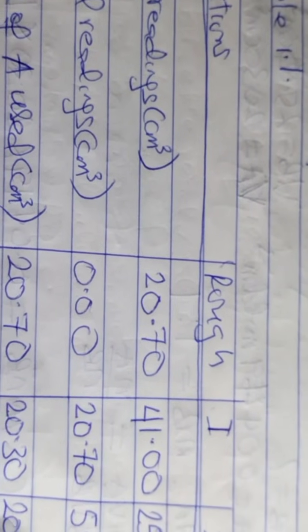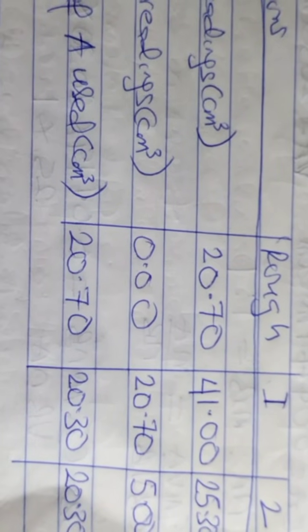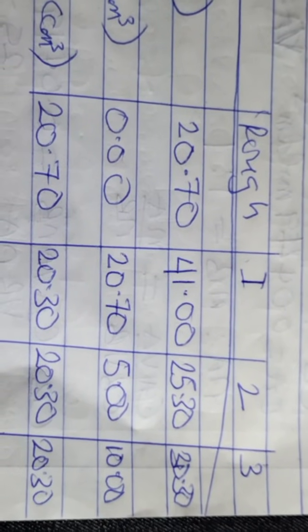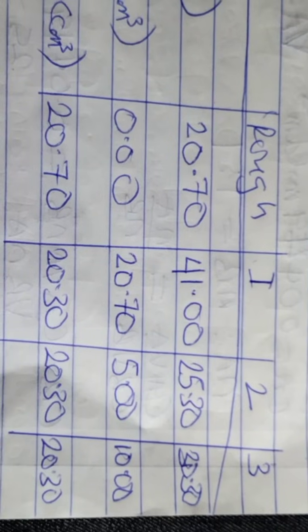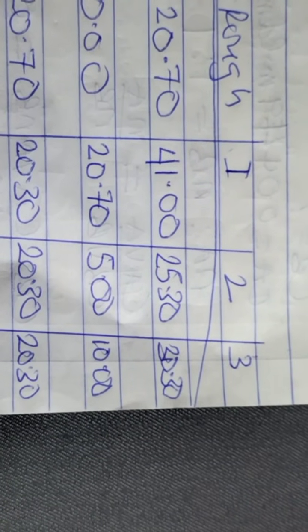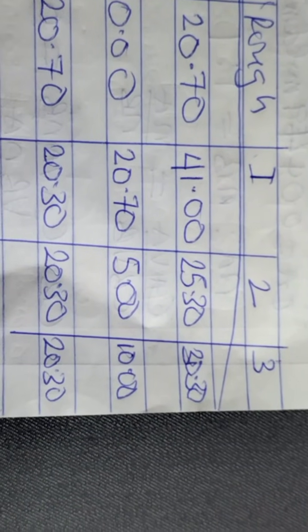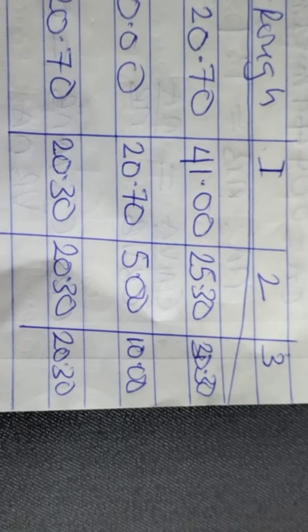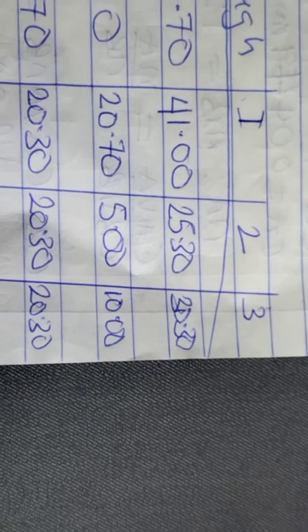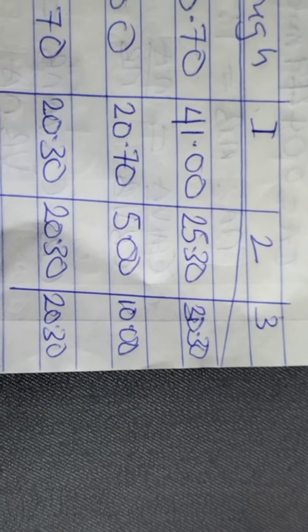We repeat: the rough, final 20.70, initial 0.00, subtract, we have 20.70. Number 1, final 41.00, initial 20.70. 41 minus 20.70 gives us 20.30. Number 2, we have 25.30 as final, initial 5.00, 25.30 minus 5 gives us 20.30. Number 3, final 30.30, initial 10.00, subtract to have 20.30.